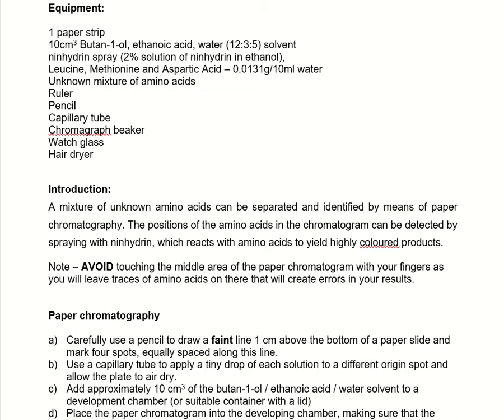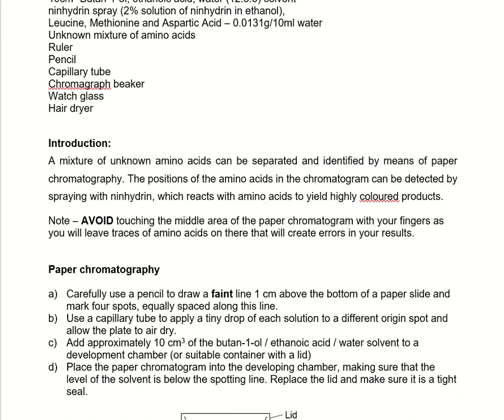So you'll be doing two practicals within it, one paper and one thin layer chromatography. The general gist of them is the same: you'll be given some standards and one unknown mixture, and the aim is to figure out what is in the unknown mixture. It'll be two of the three or four standards that you are given, and you basically need to work out the RF values and figure out what they are.